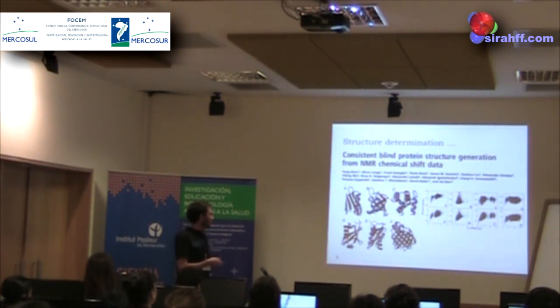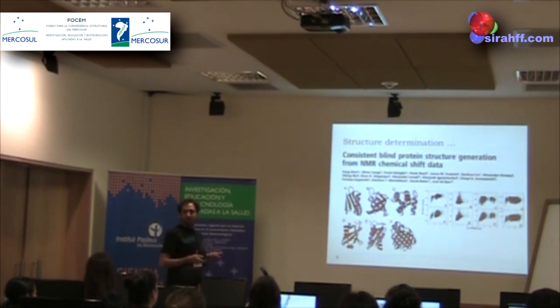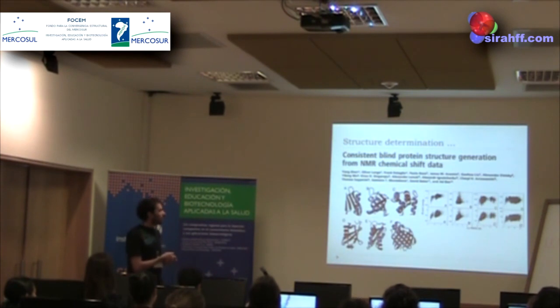This works quite well, in my experience, for small proteins, so from the assignment you can calculate the structure. The reliability is, of course, not that great, but for many purposes it will be useful and it will be better than just modeling from scratch. Okay.